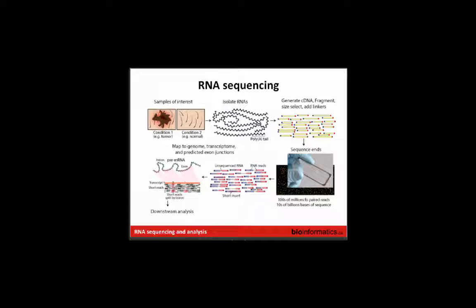And that produces these RNA-seq reads that are shown here in a paired form. So there's a blue read one and a red read two. And then there's often some little piece in the middle of the fragment that we didn't actually sequence because the two reads didn't meet in the middle. So there's some amount of unknown insert sequence. And the size of these fragments usually ranges a fair bit. So they might be in the range from, say, 250 to 500 bases. So sometimes the two reads will meet in the middle and sometimes they won't. And sometimes there'll be a different strategy where you only actually sequence from one end. The length of the sequence can vary depending on how you run the instrument and so forth. But at the end of the day, you get basically a FASTQ file which has your raw read data in it. And that, again, gets aligned against either a reference genome or a reference transcriptome or some combination of those things. And the alignments feed into a lot of downstream analysis.